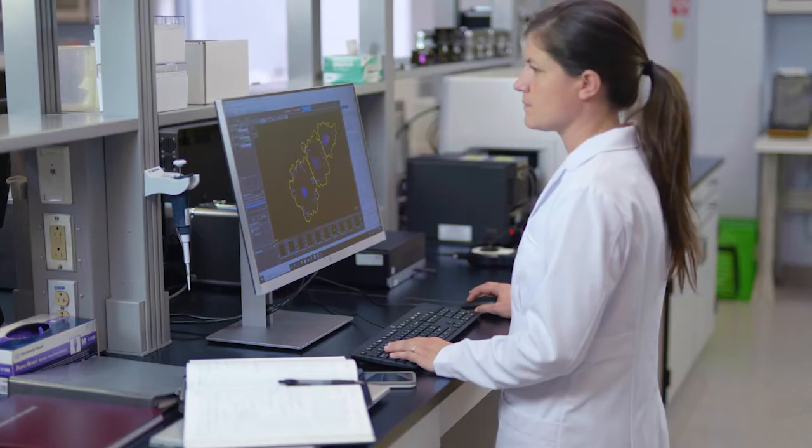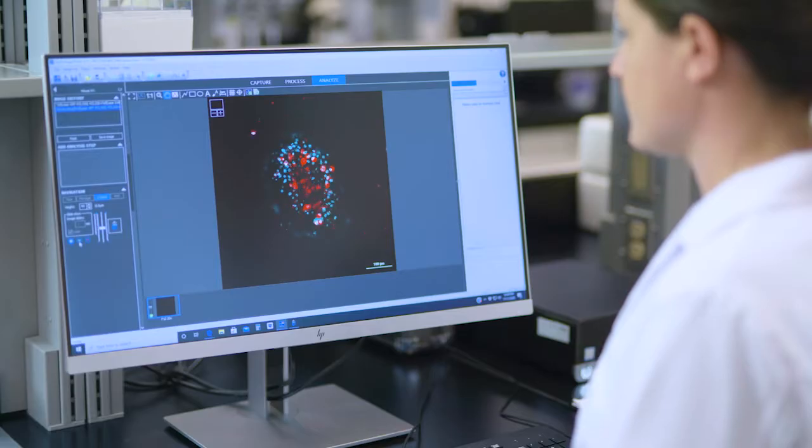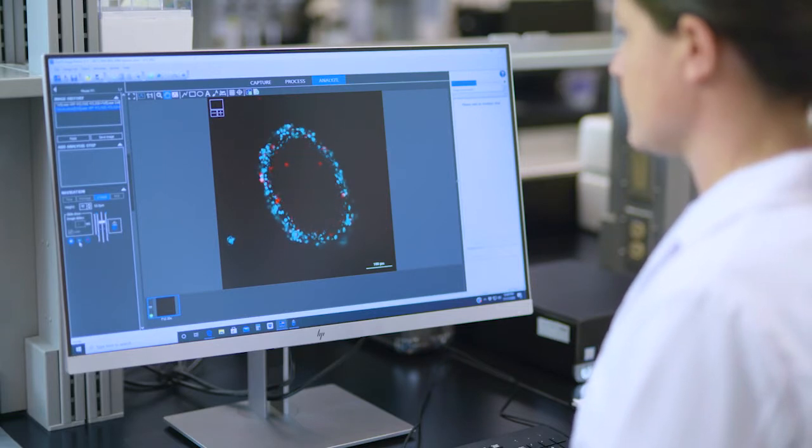Gen5 software fully automates image capture, processing, and analysis, and images are in a universal format that allows for analysis in other imaging software.